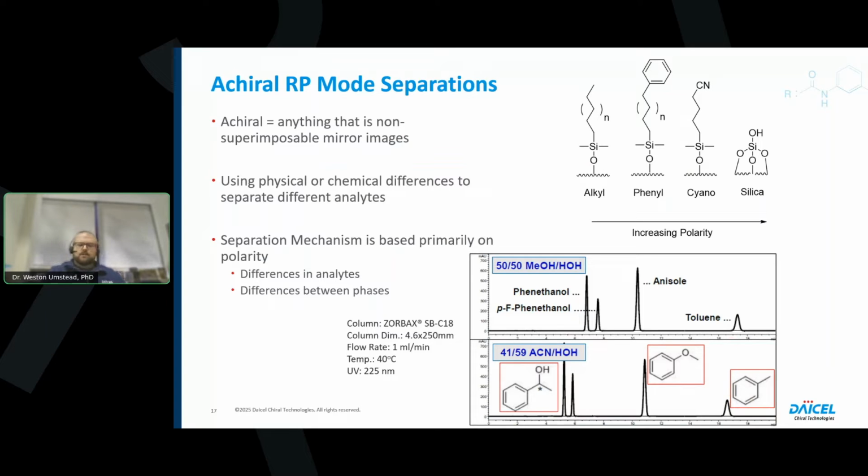But now as we start transitioning into our chiral chromatography, all of this stuff kind of goes out the window. So the predictability becomes much less reliable. And of course, like we talked about, the separation mechanism needs to be changed because we can't just use polarity anymore. So take these into consideration as we start this journey. Achiral chromatography, not saying that it's easy, but it's easier, at least in terms of prediction and what's going to work for these separations.